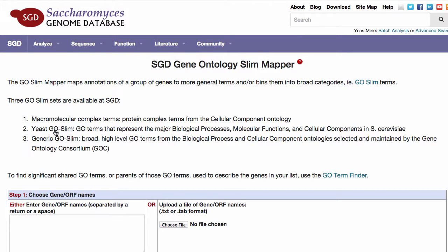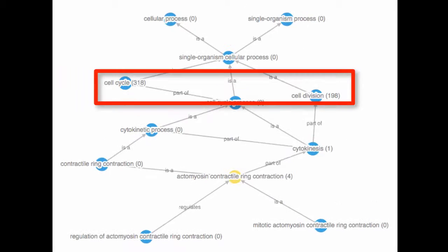The GoSlim Mapper identifies higher level branches of the ontologies common to a list of genes based on their GO annotations. These higher level terms represent the major branches of the ontology, also known as GoSlim terms.